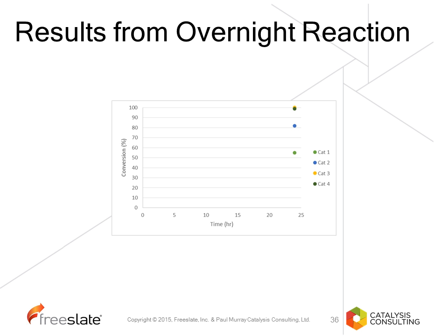So here we have the results of 4 reactions. These are catalytic reactions where we have changed the catalyst or ligands. We have carried out 4 reactions. We have left the reaction to run for 24 hours. And what you see is that 2 reactions give us 100% conversion at 24 hours. 1 reaction gives us 80% conversion, and 1 reaction gives us 60%. So based on that one experiment, you could pick either Catalyst 3 or Catalyst 4 and run your process with those. But we don't know whether Catalyst 3 or Catalyst 4 are better or if there is any difference between those 2 catalysts.